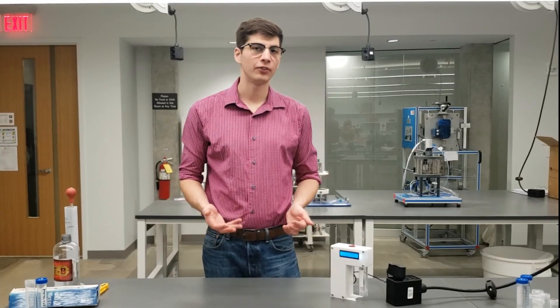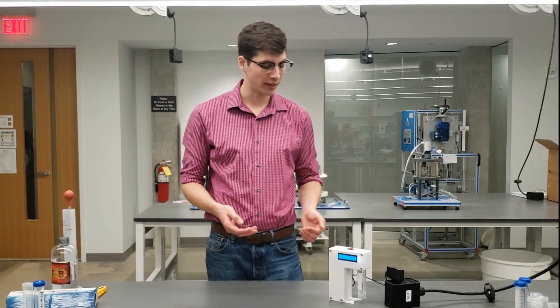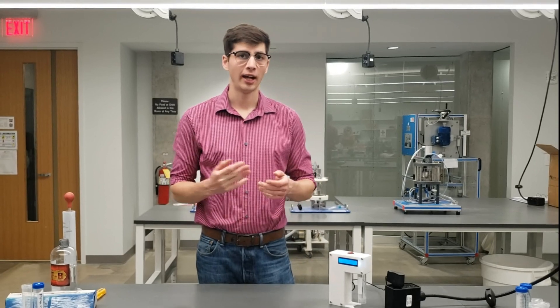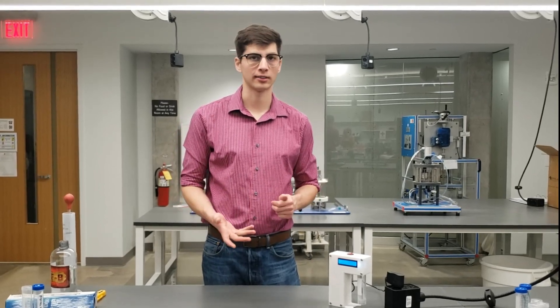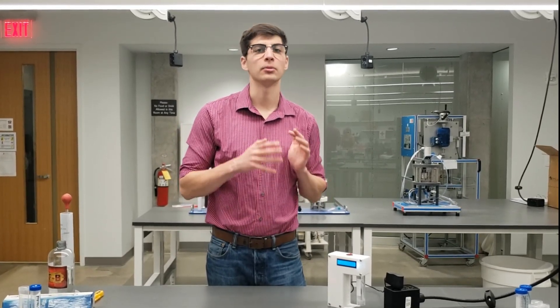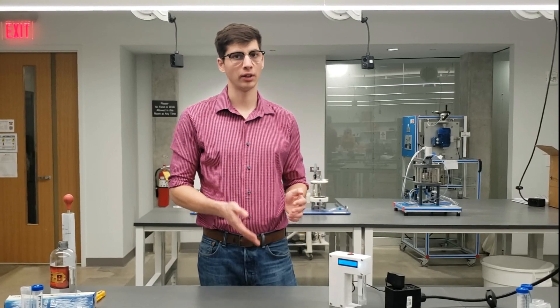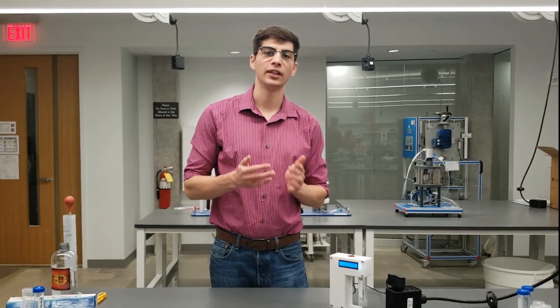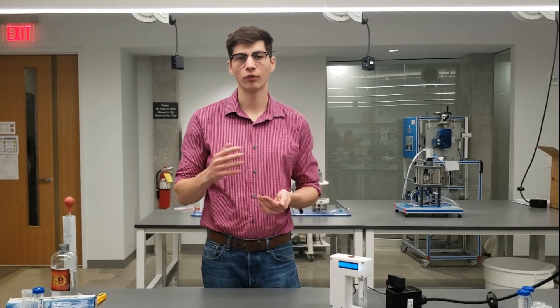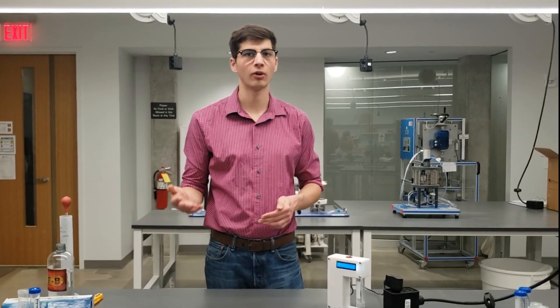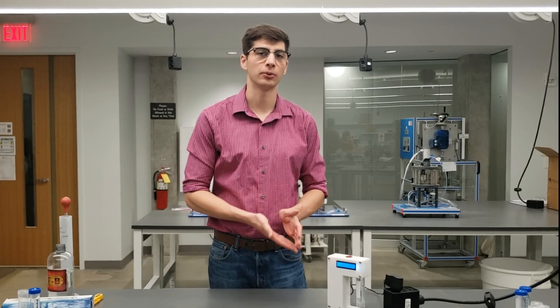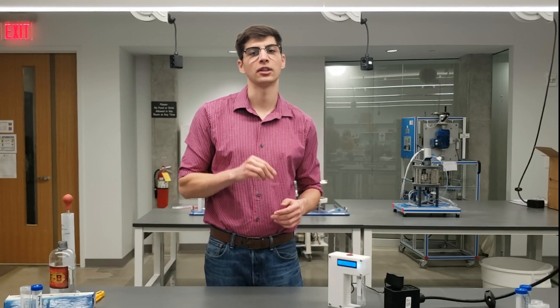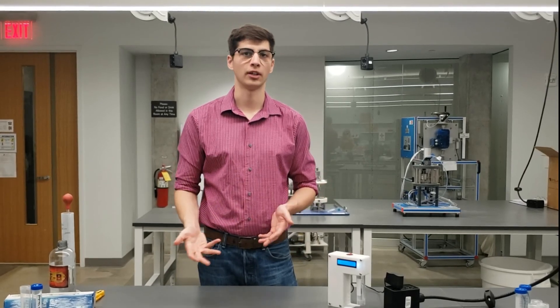A few of the features of the alcohol detector are that its detection range is between 0.1% and 2.0% alcohol content. However the detector has been found to be most accurate between 0.1% and 1% alcohol content. So if you have any samples that you would like to test over 1% or over 2% alcohol, what you can do is a simple dilution in order to get the sample into that detection range. And I can show you how to do this in a separate video.